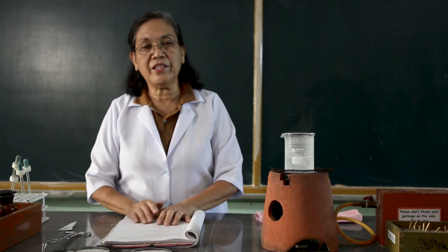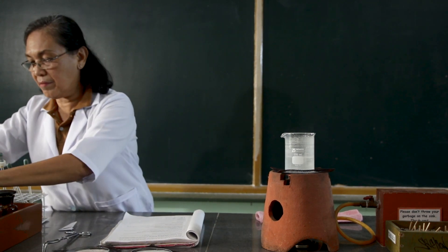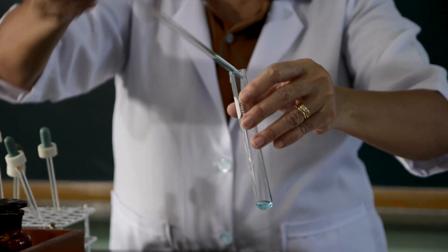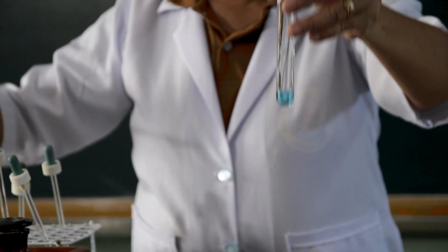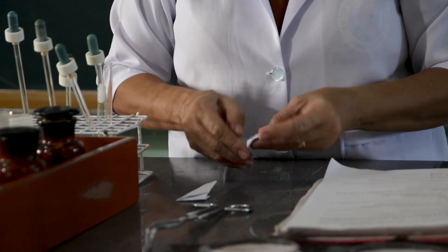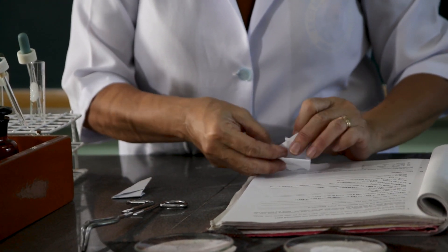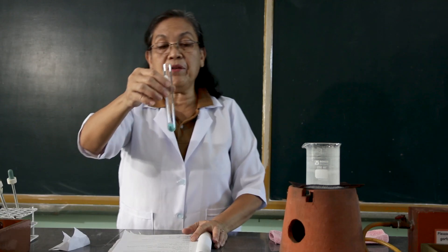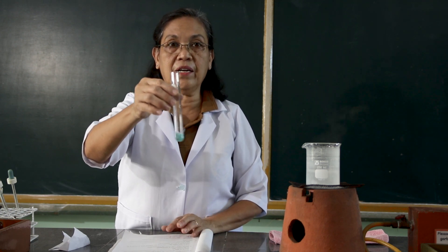And we will prepare another salt by the reaction between copper sulfate solution and magnesium ribbon. This is the copper sulfate solution and we will add this with a magnesium ribbon. I want you to observe what happens. We will decant the supernatant and allow it to be evaporated on the water bath.